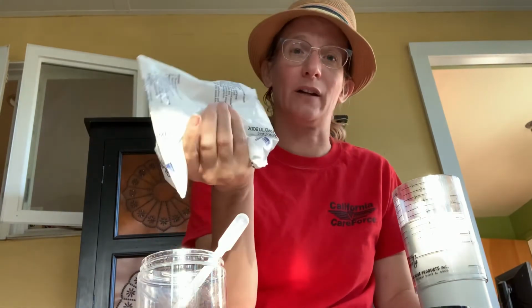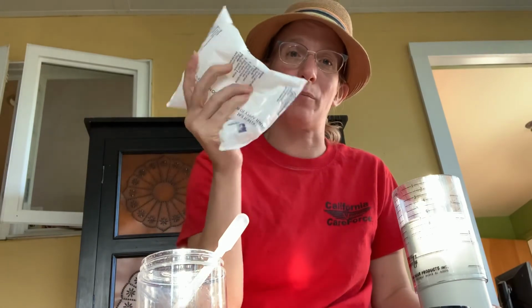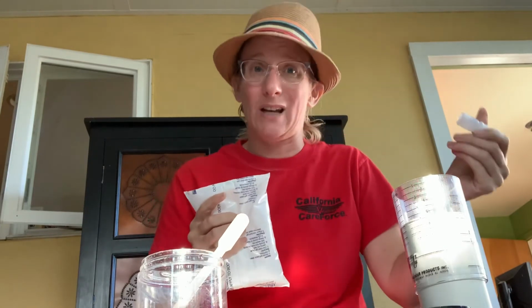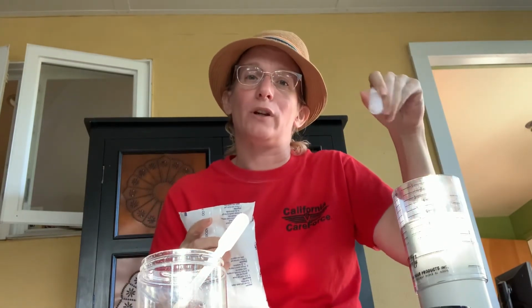Now, what I did to keep it warm while I was going from hive to hive is I got a hot and cold pack that I warmed up to about body temperature, and then I put it in the pocket of my bee suit up against my body, and tucked it in between that and me so that it stayed warm while I was outside because it was cool out the day that I was doing this. I'm not sure if that's entirely necessary before you do the formal incubation, but I wanted to be sure that it stayed warm, so that's an easy way to do that.